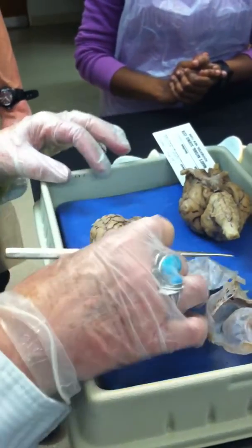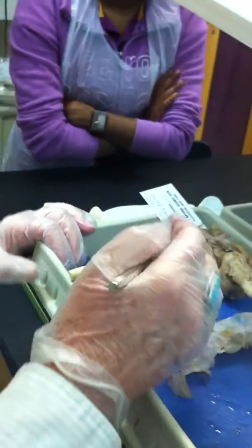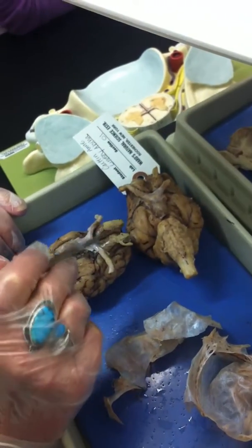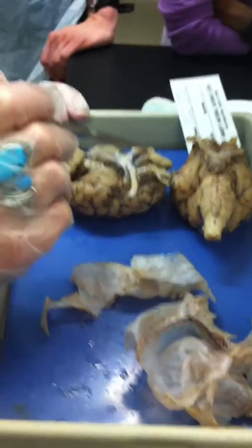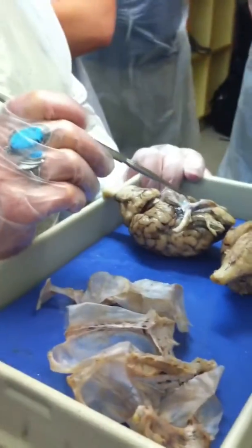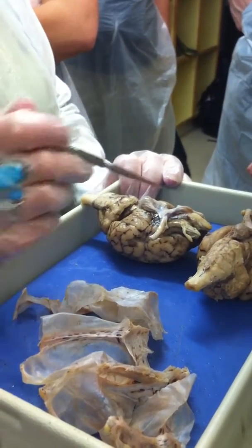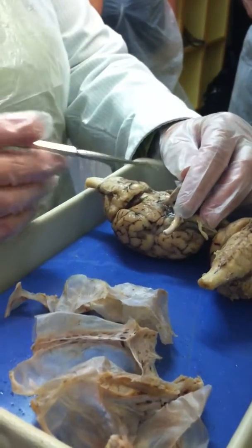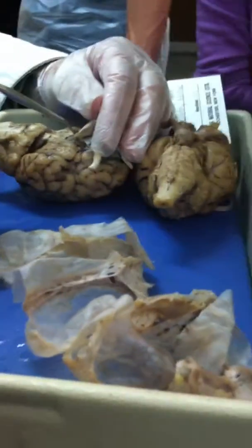You know that this is the cerebrum and this is the cerebellum, okay? I'm going to turn this over, and you see the olfactory bulbs. Remember, they sit in that cribriform plate of the ethmoid, okay? Here are the optic nerves, the optic chiasma. You have the optic tract behind there. Here is the pituitary gland. So, optic chiasma, and then right underneath the optic chiasma, you have the infundibulum. Well, this one actually broke off, and so you have just the hole there.